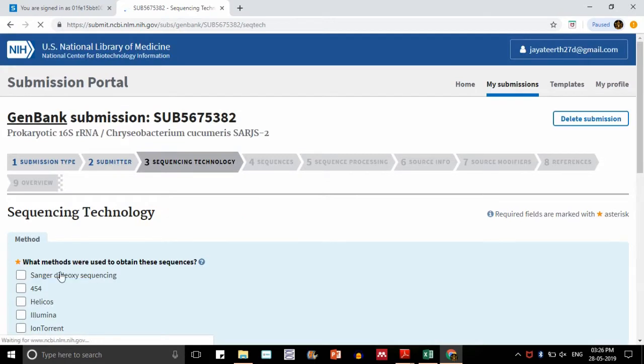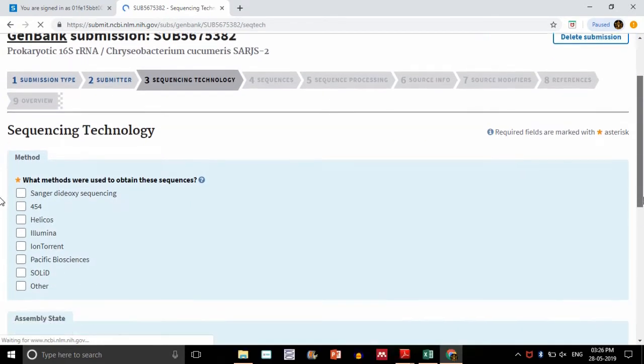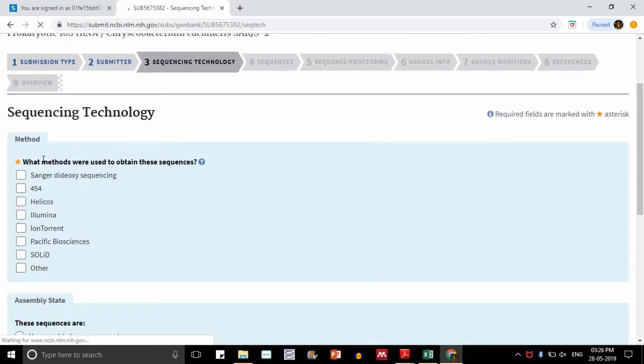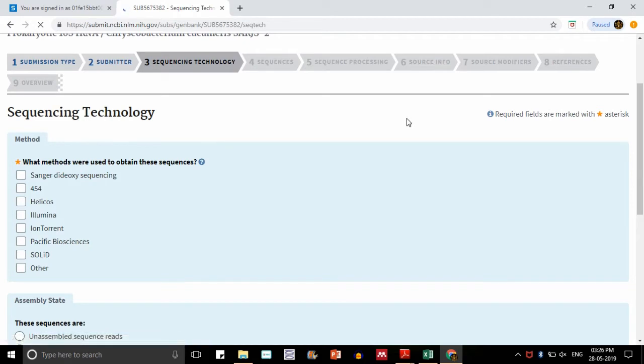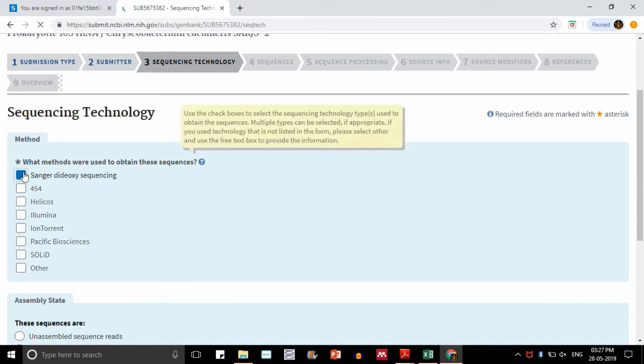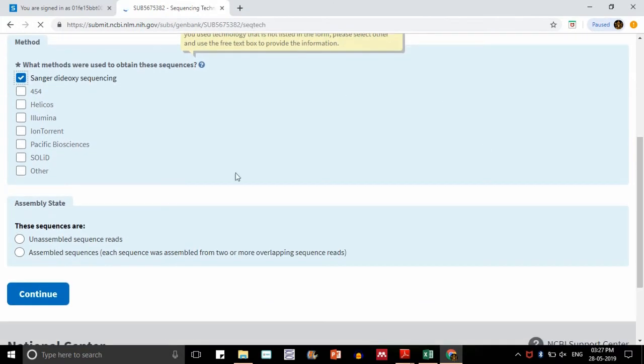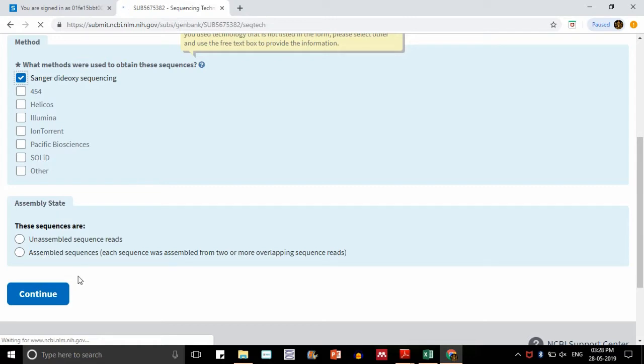It will take us to the next step, that is sequencing technology. For our sequencing, we have used Sanger Dideoxy sequencing technology. I am not sure about all these things, we have not done Illumina or any other things, so I am just selecting the first option. There are a lot many next-gen sequencing technologies going on, but my technology used for my organism sequencing is Sanger sequencing. Assembly state I am not sure of, and it is not a required question, so I am just skipping it. I will just say continue so that I can go for the next step.